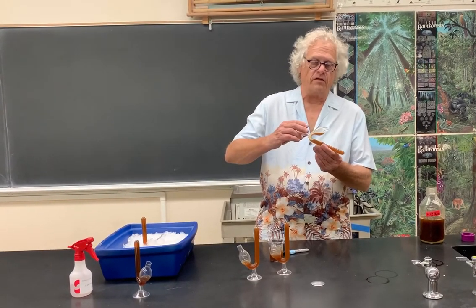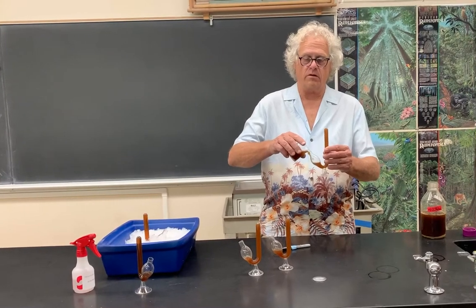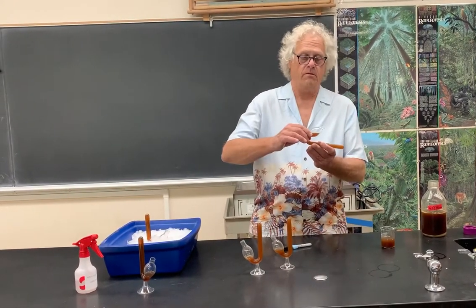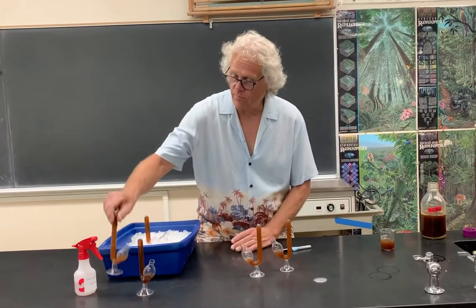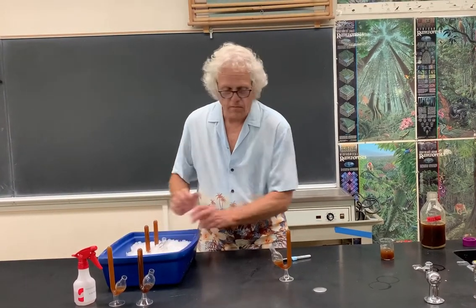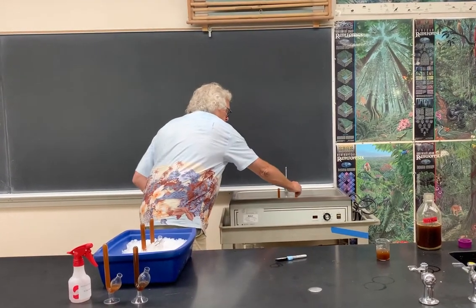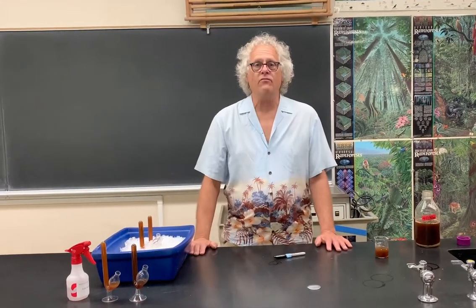If you have to do this in the classroom, I would probably let that yeast and molasses mix a little bit longer so it'd be very homogeneous. One of these I'll leave at room temperature next to that control. One of them I'll put here in the ice bath. And the last one I'll put back over here in the warm water bath so we can incubate at a higher temperature. And now I'll wait about an hour and a half and we'll see what happens.